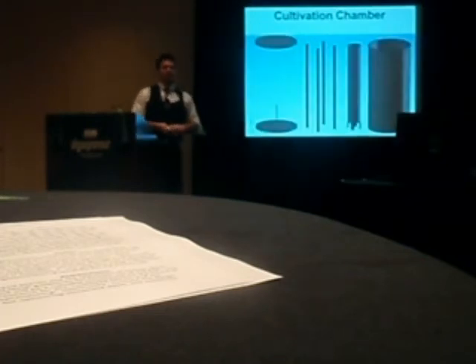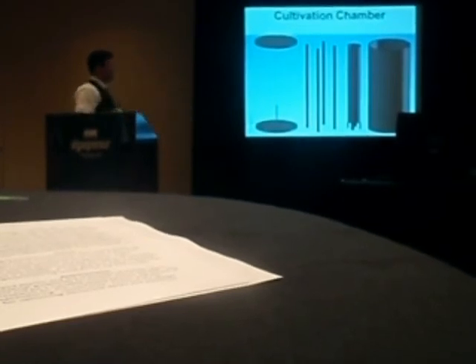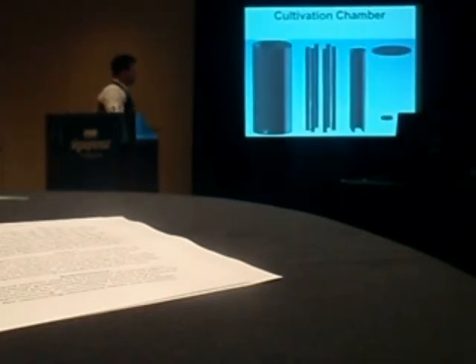So you can start to see we started out with a CAD diagram. These are the individual constituents. You can see you have your top and bottom plate, light columns where the LEDs are going to go, your draft tube, which is the inner tube where the stream comes up, and then it comes down to the outer tube. This is another one with modeling 6 light columns.